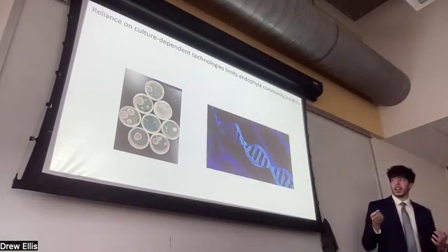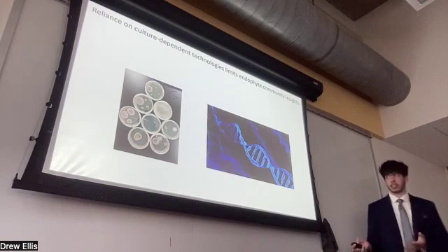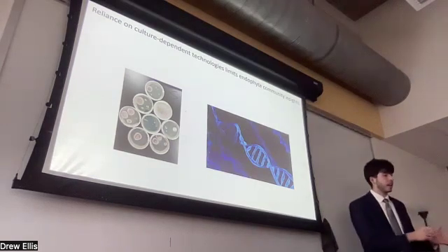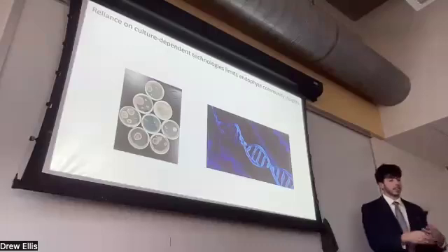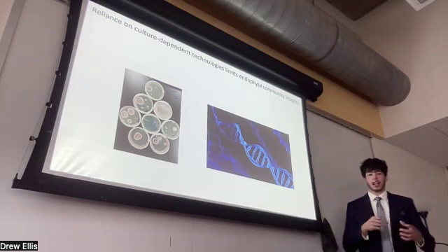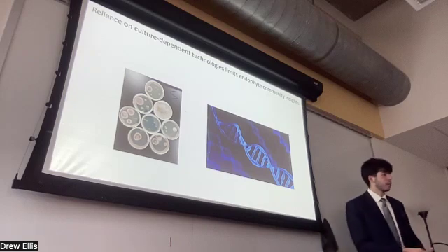Well, we used a high throughput technology such as next generation sequencing. And what this allows you to do is compare DNA across the entire sample, and you can identify it on that ITS region that I showed you earlier. You can identify as close down to species as you can, and do a comparative analysis based on what's actually in the community at large, as opposed to what is present that you can culture.